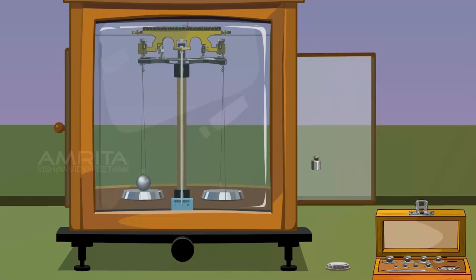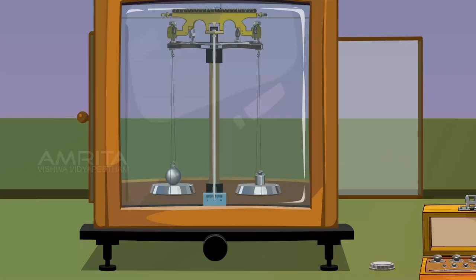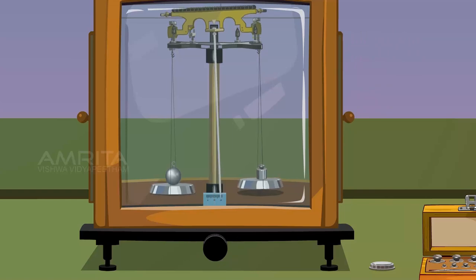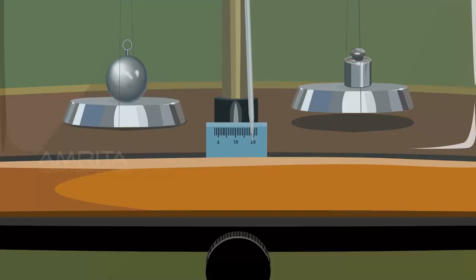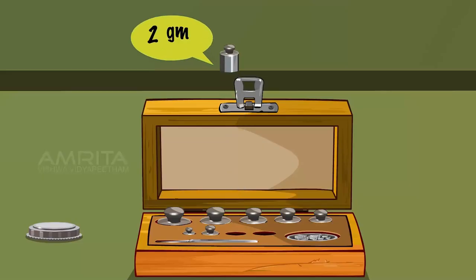Change the weight. Now place 5g. Release the balance. The pointer stands in the right. Then we place 2g and oscillate.